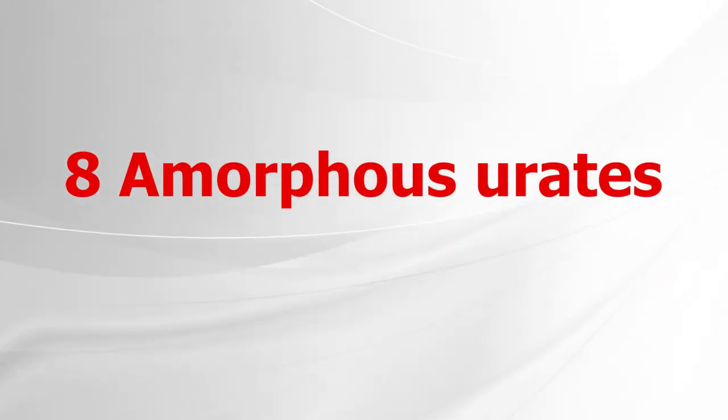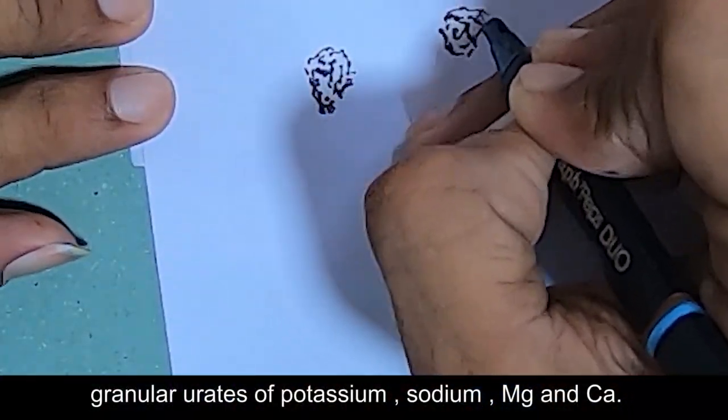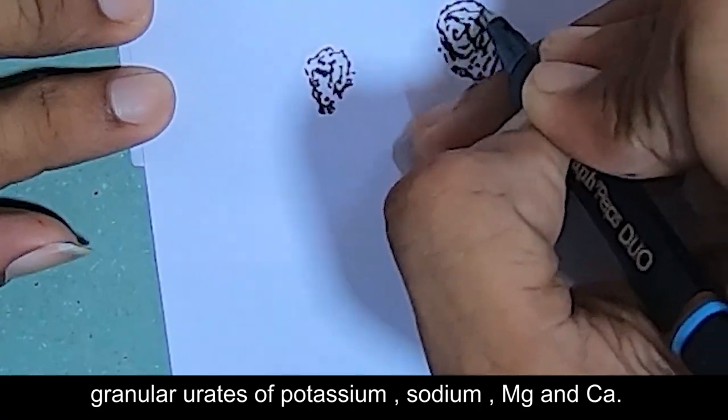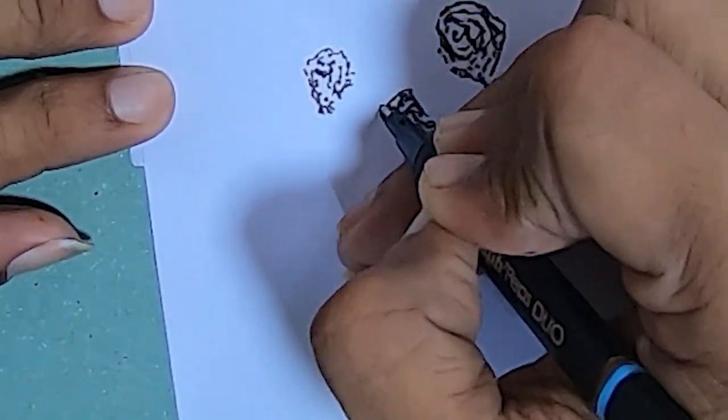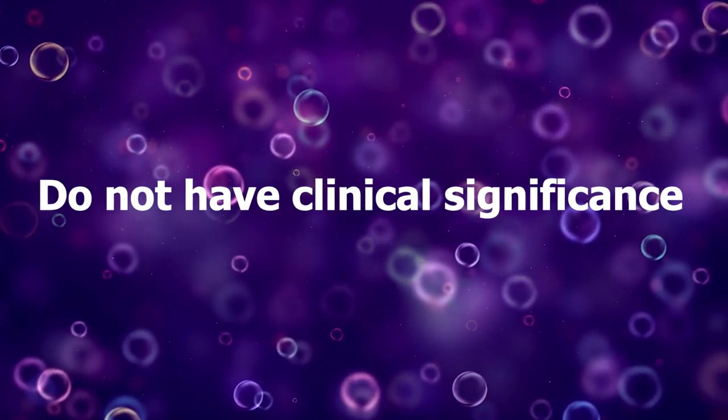Amorphous urate crystals. These are granular urates of potassium, sodium, magnesium, and calcium. But these are not clinically important too.